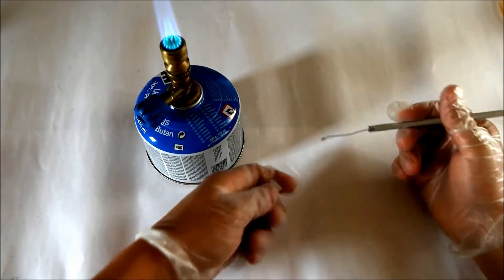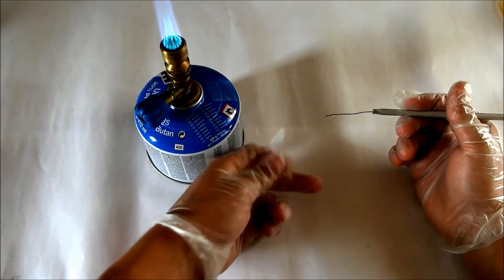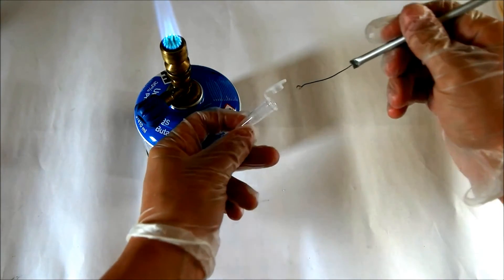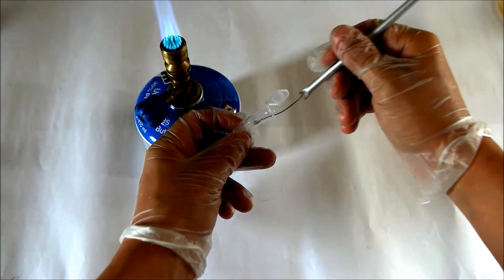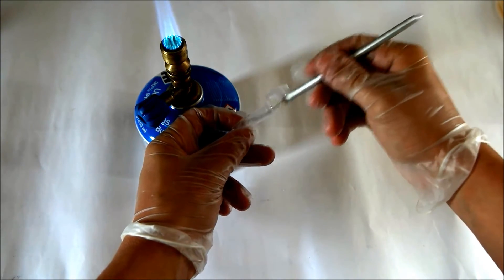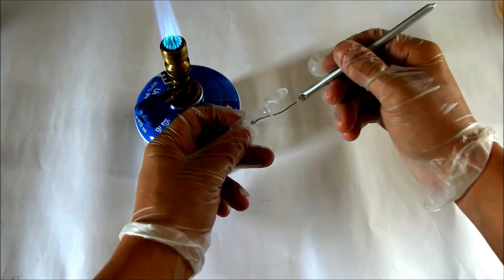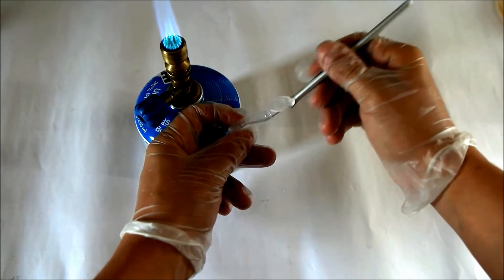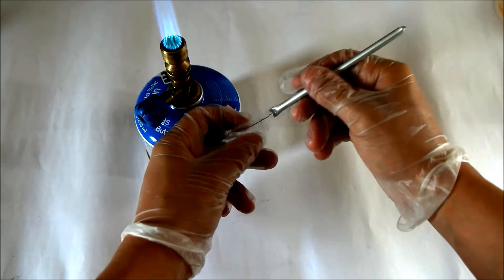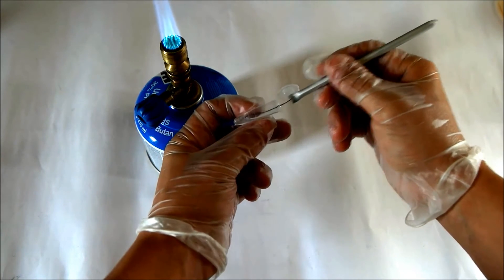Now try to get your bacteria in the eppendorf tube with the sodium chloride solution. This needs a bit of practice, but you can wait a bit to let them dissolve in the solution, and then that should be done.